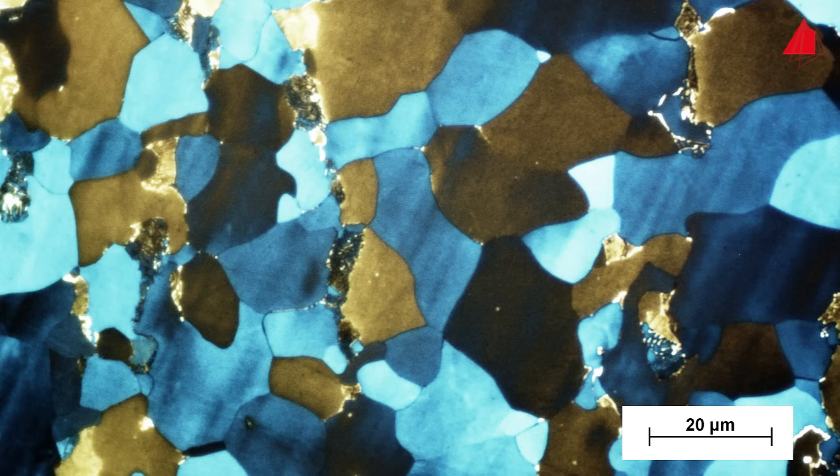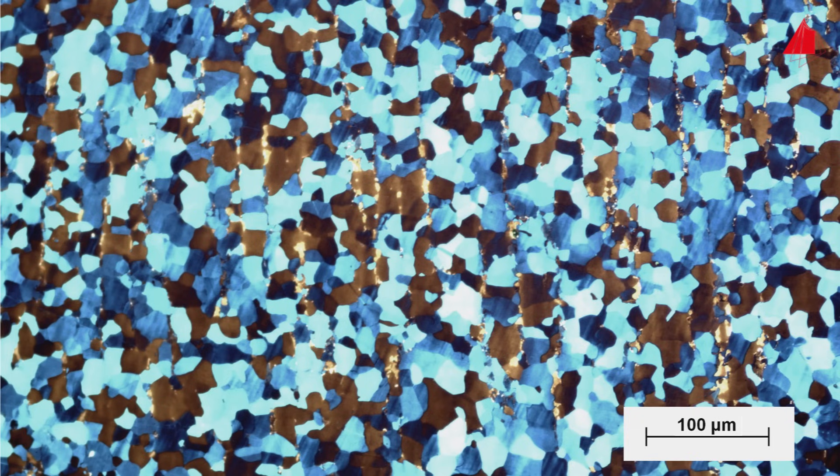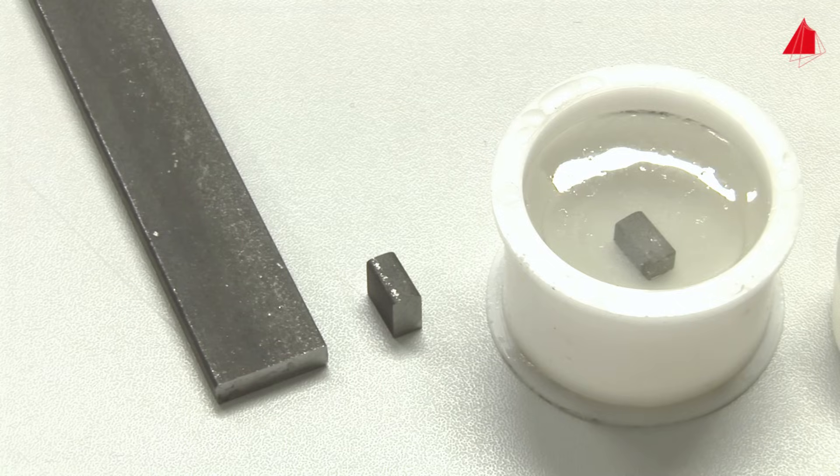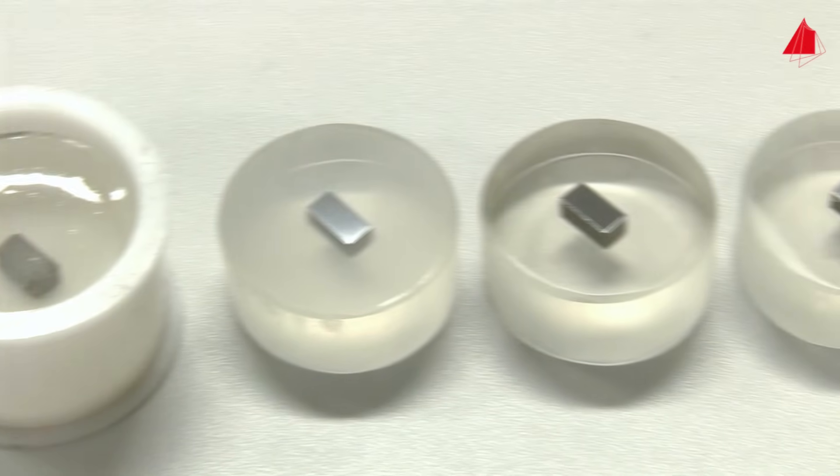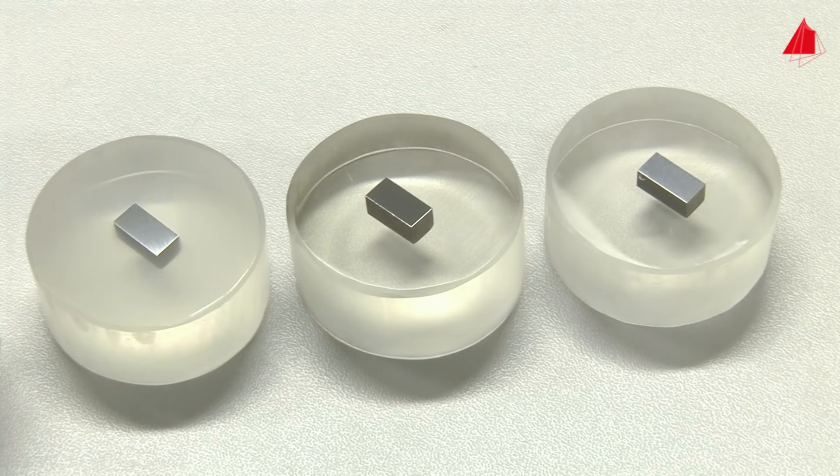The variety of materials is huge and each material needs its own individual preparation method in metallography. The preparation is often not conducted by hand as shown here, but by automatic methods. This saves time and money. The principle, however, is always the same: sectioning, mounting, grinding, polishing and etching.